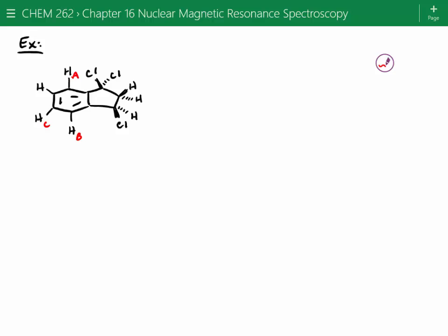So let's label this one C. C, if it looks all the way past proton B, it sees 1 carbon. If we look at this proton up here, which I'll label HD, it looks past proton A and it sees 2 carbons. So it's got a different vantage point, right? Or chlorine. Did I say carbon? Sorry. If it looks past proton A, it sees 2 chlorine atoms. If we're looking at proton C, it looks past proton B and it sees only 1 chlorine atom. So we've got 4 different aromatic protons.